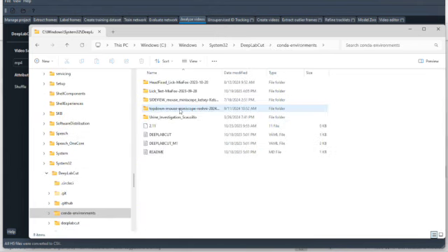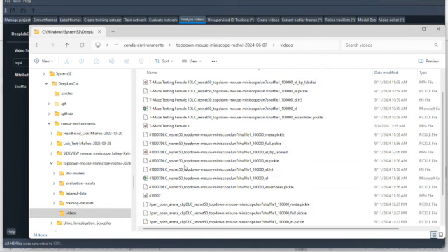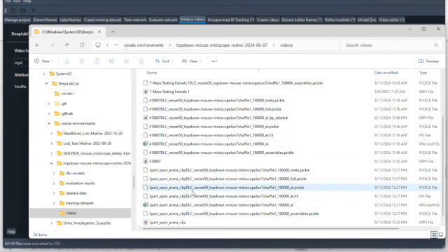Okay, so in our videos folder, we're using this clip here, and we have all the outputs of this. So we already analyzed this video.